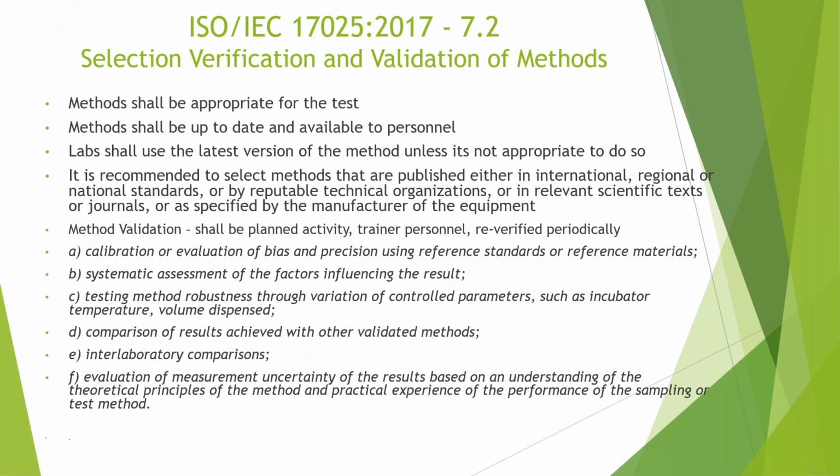So I want to talk a little bit about 17025. If you were part of our last webinar on the update to AOAC, we touched upon the requirements in section 7.2, which is a lengthy section about the selection of methods. It also talks about validation of methods.